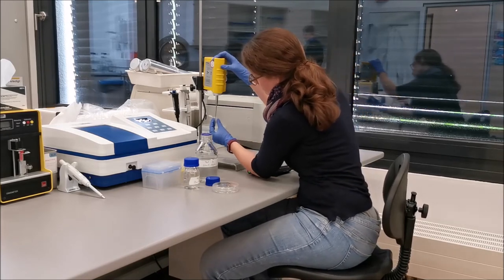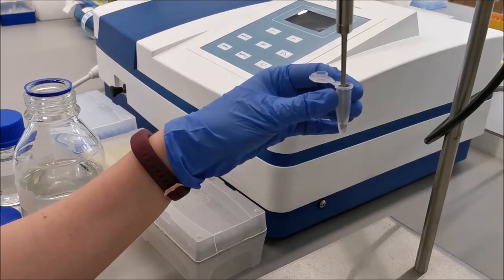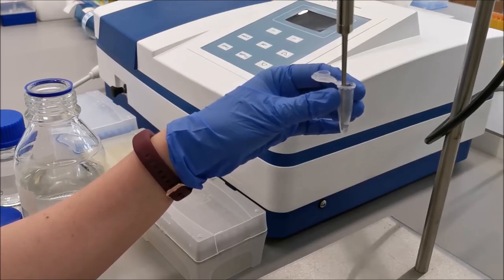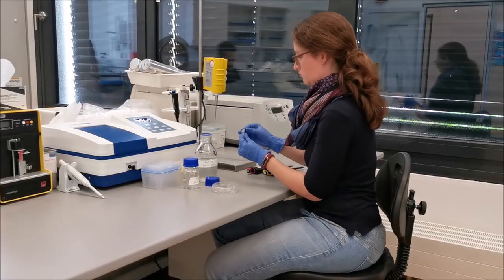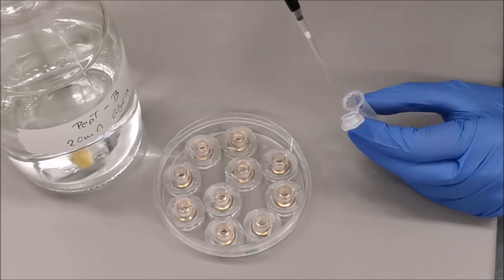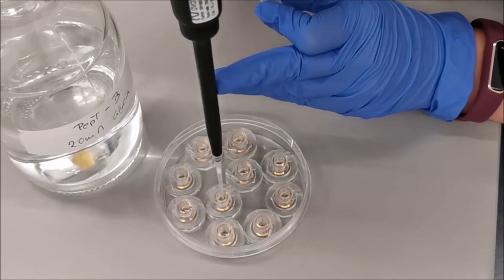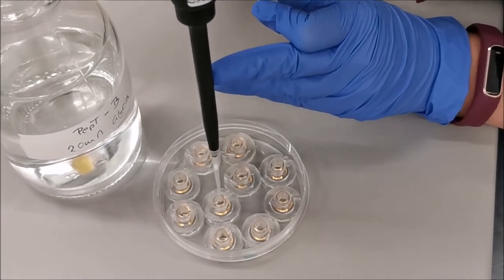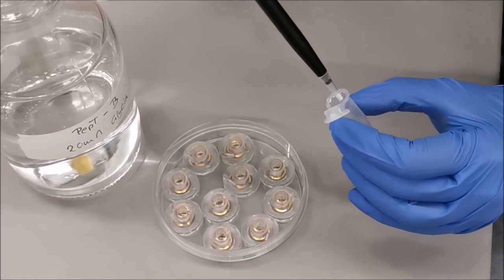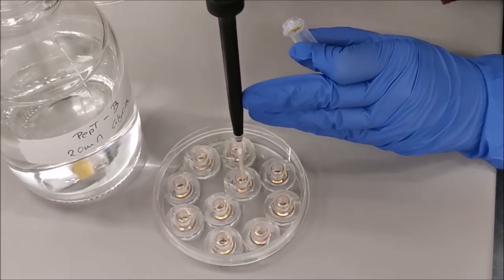The sample needs to be sonicated using a tip sonicator to get a homogeneous suspension. This is to break membrane clusters which appear when the samples are frozen. We are using 10 bursts in 1 second intervals. Without sonication, the sample won't adsorb nicely to the sensors. After sonication, the sample is ready to be added to the sensors. We add 10 microliter of the sample to each sensor by submerging the pipette tip into the solution and slowly releasing the sample on the sensor surface.